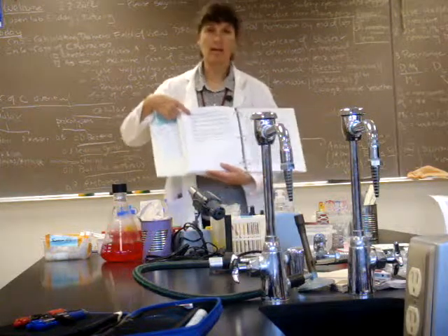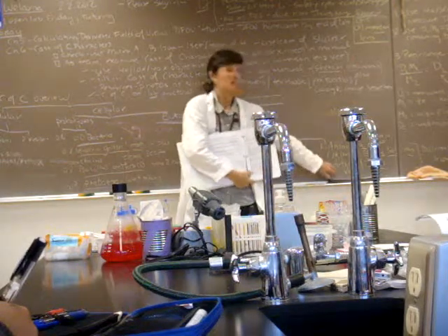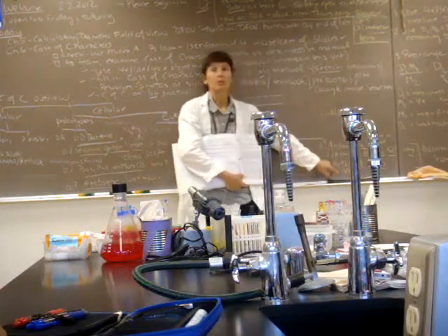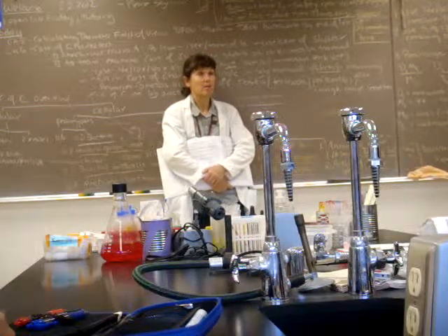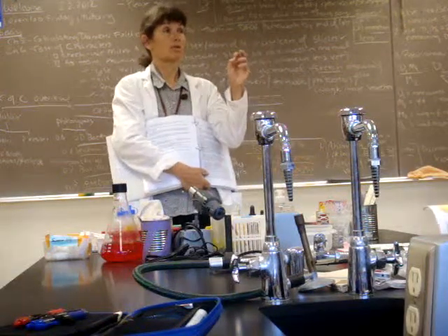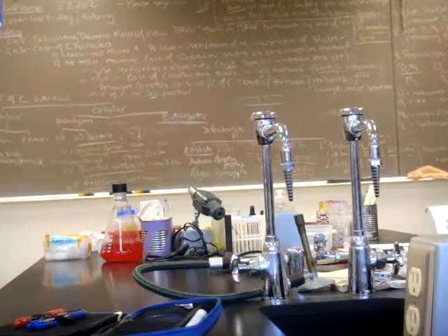The last cast of characters that you'll be looking at is a mosquito. This particular mosquito belongs to the genus Aedes. We've included it because mosquitoes act as important vectors of microbial pathogens. We call them arthropod vectors. And again, the Aedes is so big, you really don't need a microscope to look at it. But what you can do is put it, again, under the dissecting scopes.